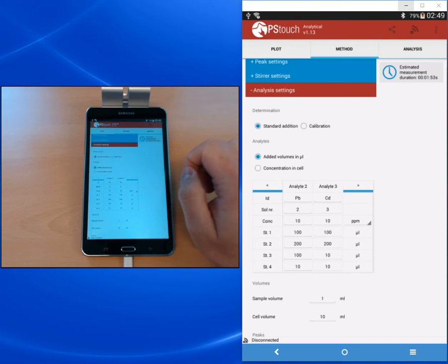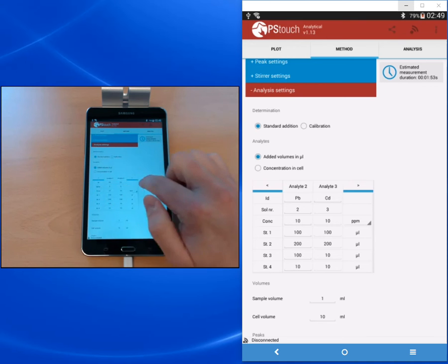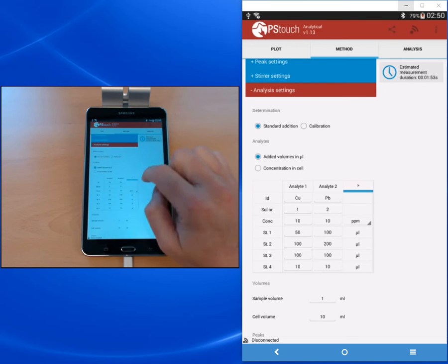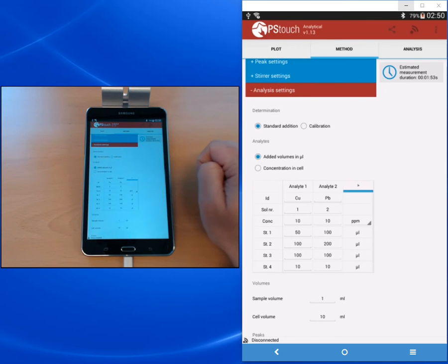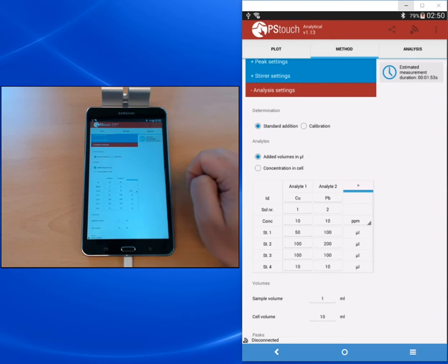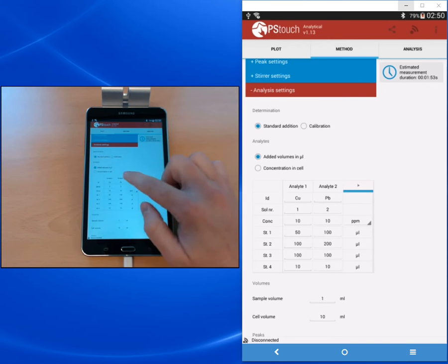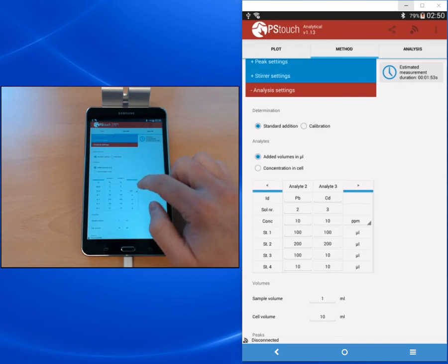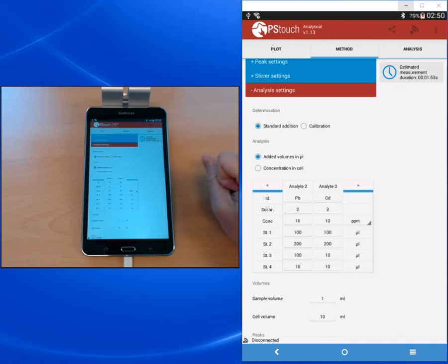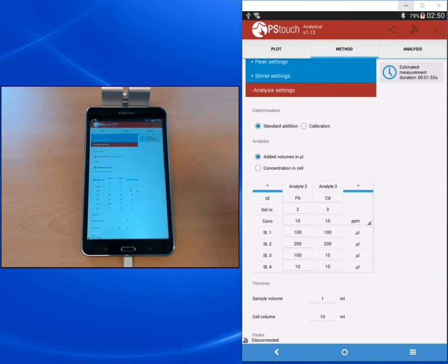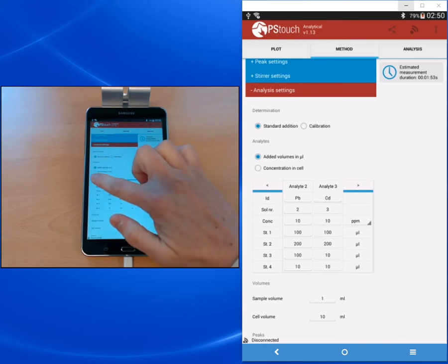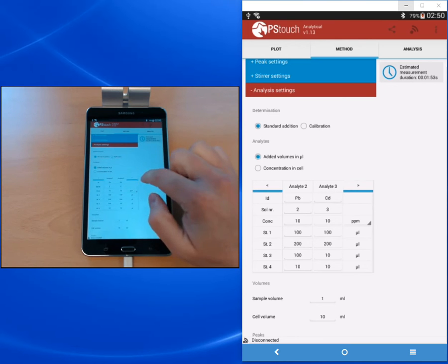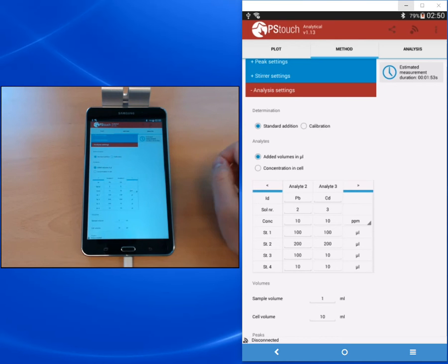The next row is the solution number. The solution number determines if you are using different solutions or the same solutions. At the moment we have copper one, lead two, and cadmium three, meaning we have three different standard solutions. If you would have a combined lead and cadmium solution, you would enter the same number, so in this case two and two, into the fields. Then the software would know that every standard addition of volume for one of them is also an addition for the other one.